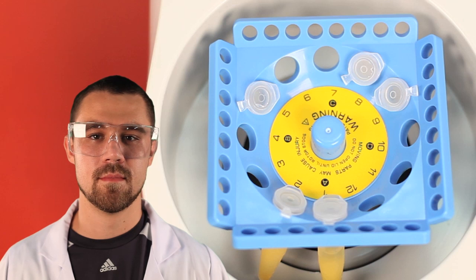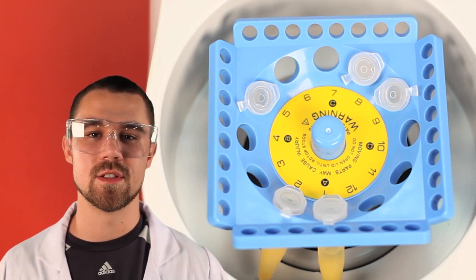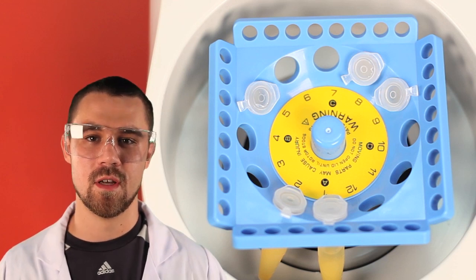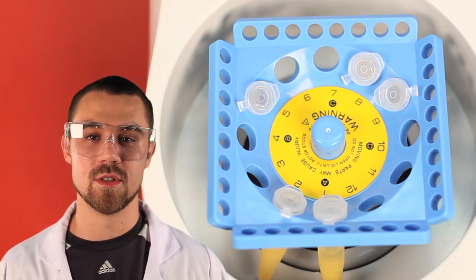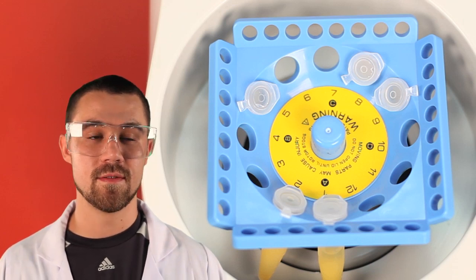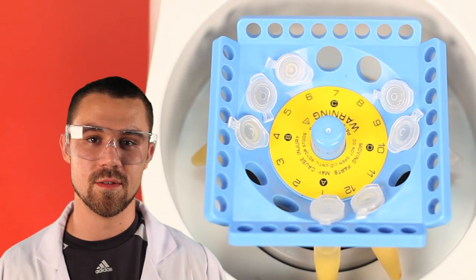Tip time. If you run out of balance tubes or you're having trouble finding one, you can still balance your centrifuge depending on microtube arrangement and style of centrifuge. With a 12-slot centrifuge like the one we're using today, you have the option to balance 5 and 7 without a balance tube.